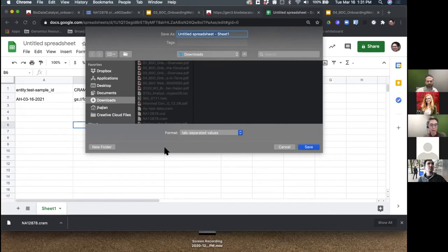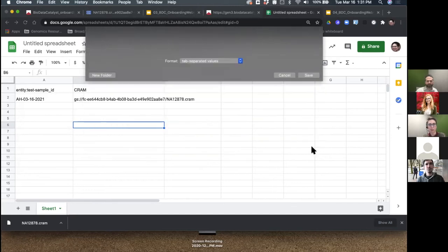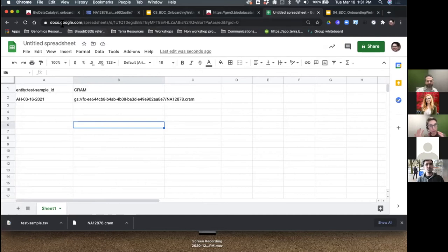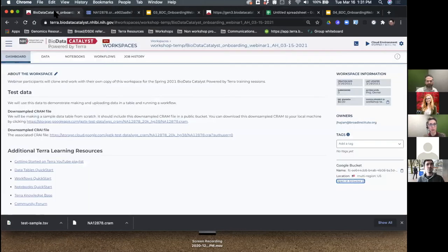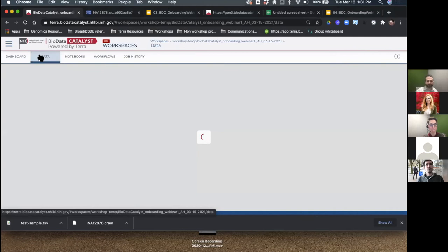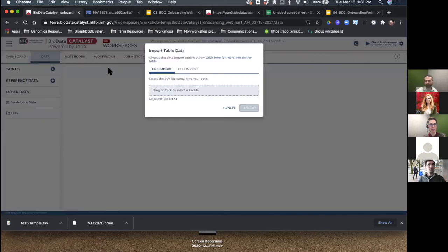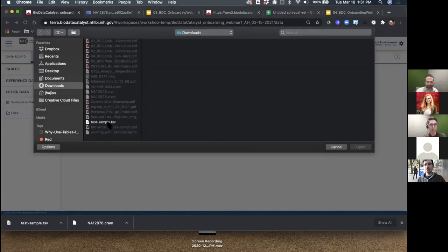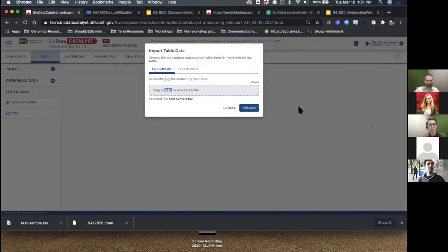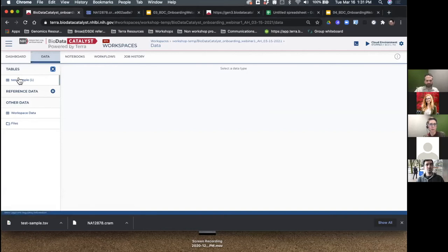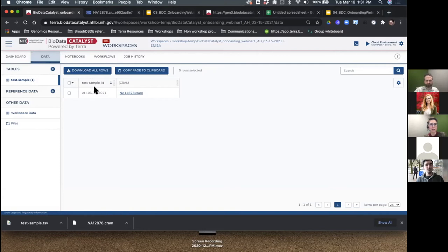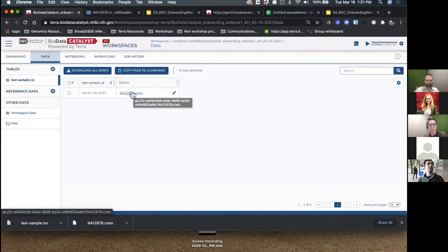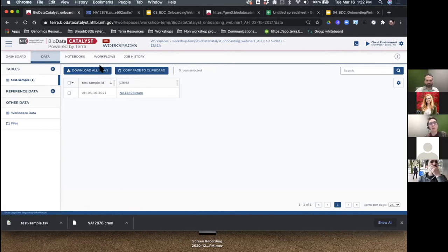You have the ID column and the data column with the CRAM and full path. The next step is to save it — in the case of Google Sheets, download it as tab-separated values. If you're in Microsoft Excel, save as tab-delimited text (.txt). Terra accepts both. Once you've done that, that is your table. Return to your workspace data tab, click the little blue plus icon, and drag-and-drop or click to select the file. When you upload it and click to expand, there it is. Congratulations — you've created and uploaded your first data file.